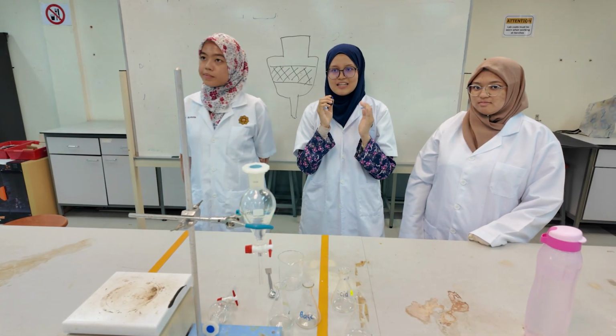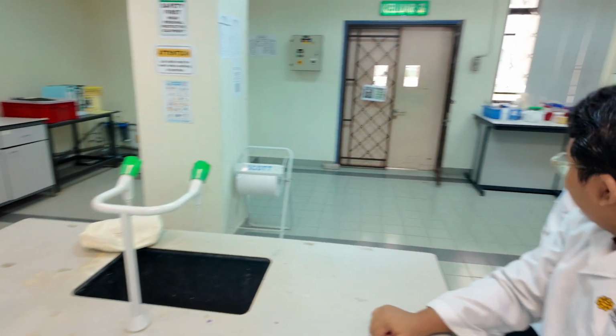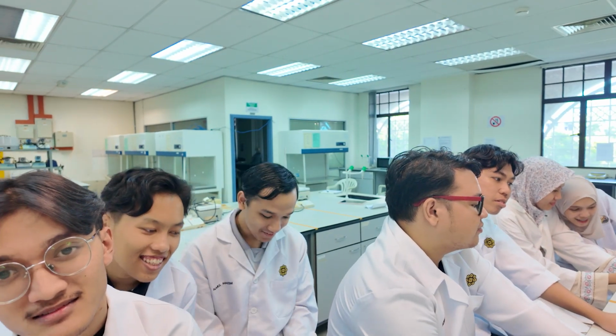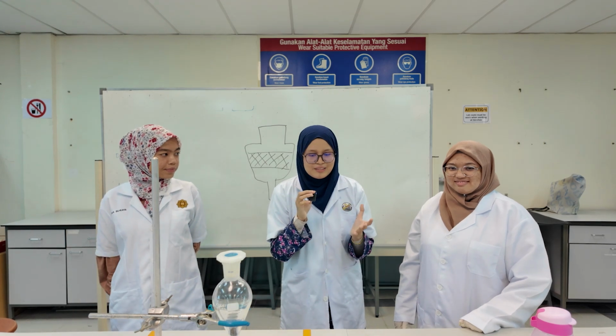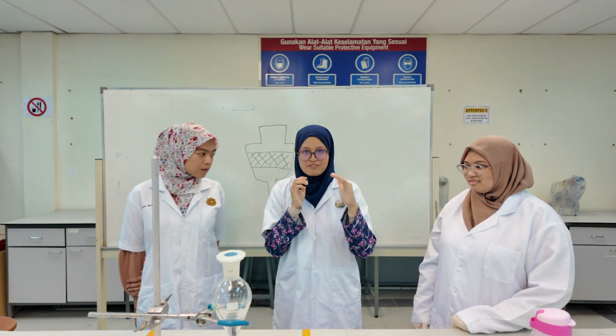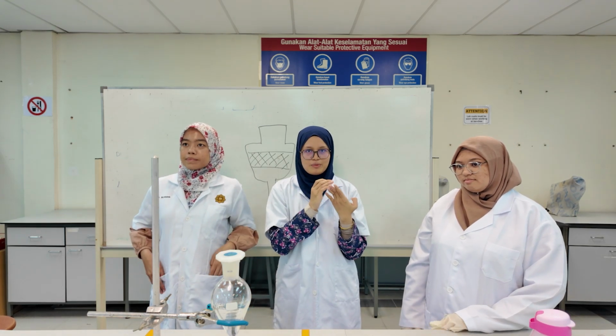In real chemical reactions and also natural extraction, the final product is always messy because it contains 4 components.